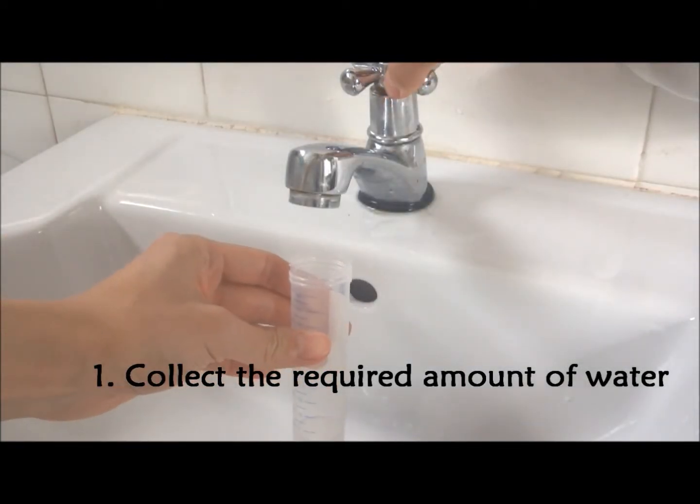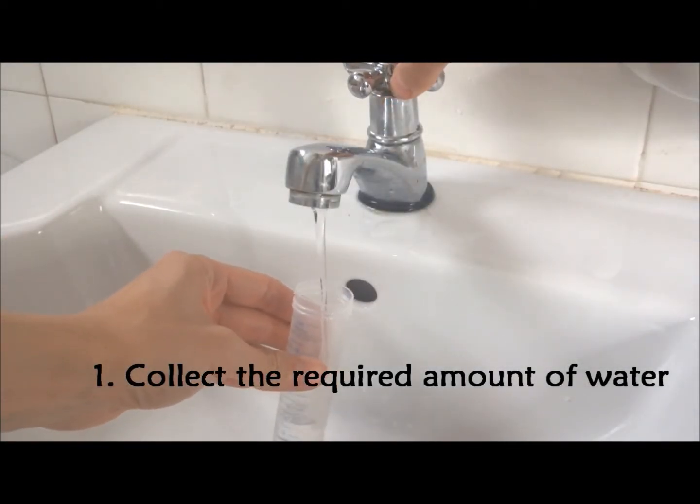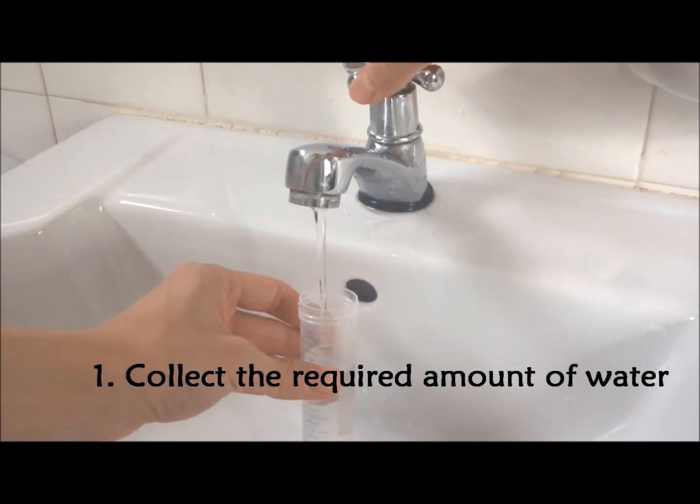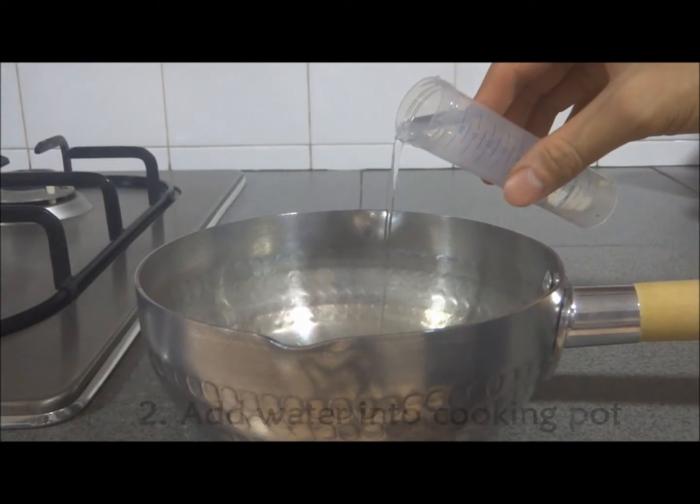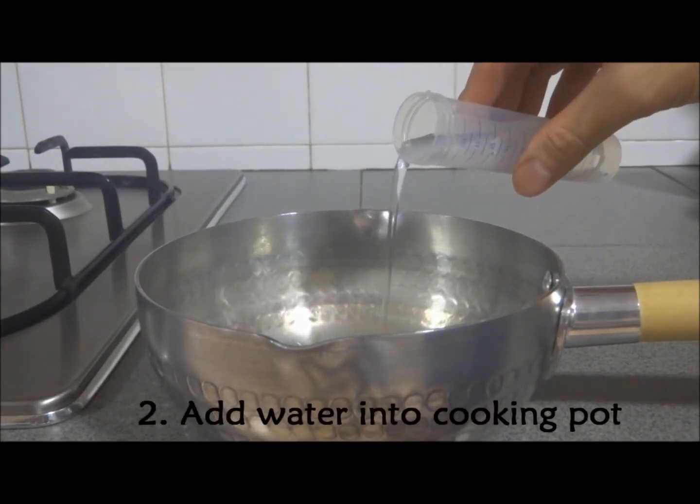Step 1. Use the falcon tube to collect the required amount of water. Add the water into a small cooking pot.